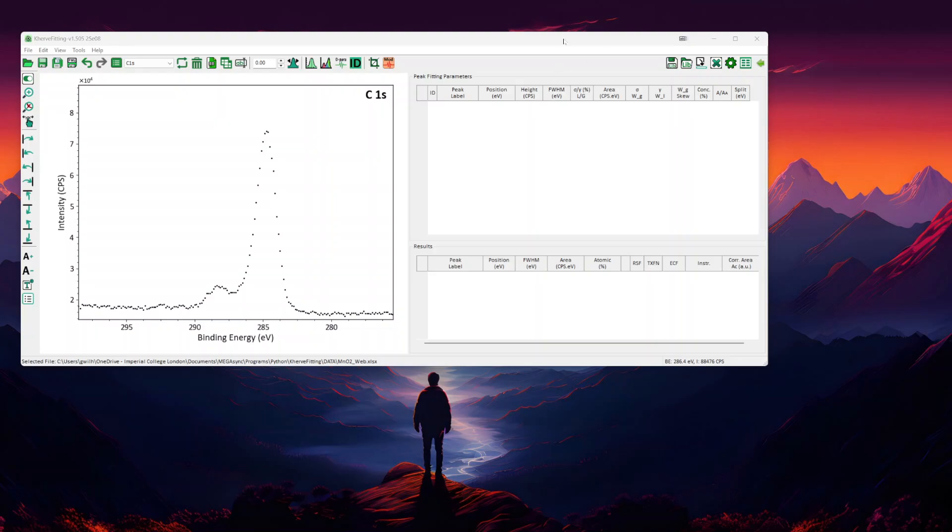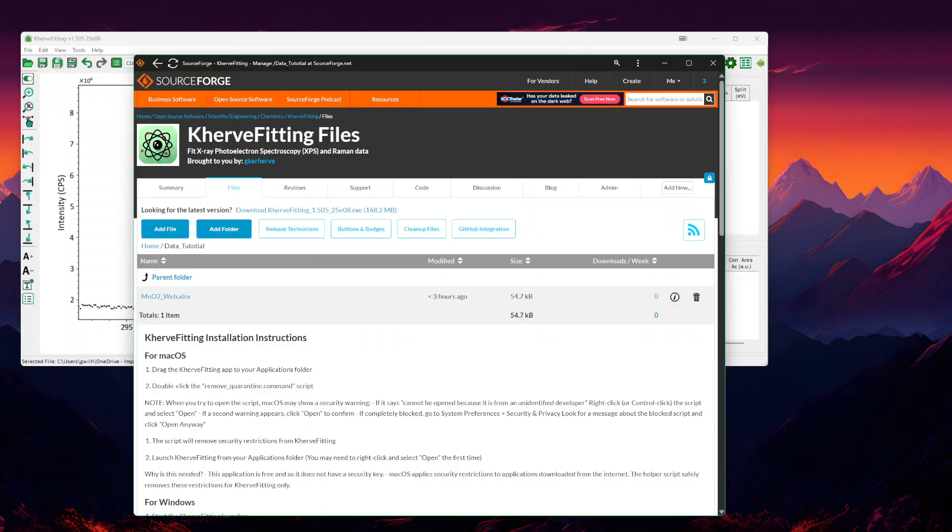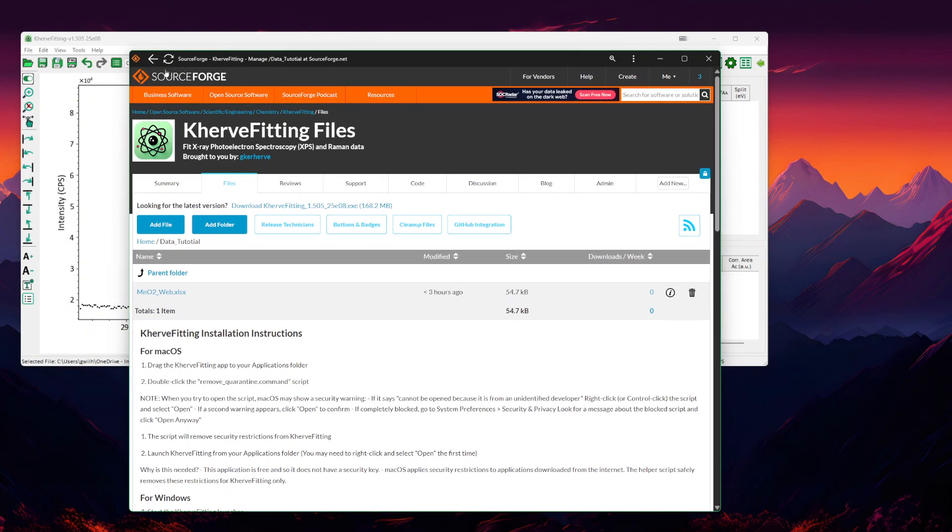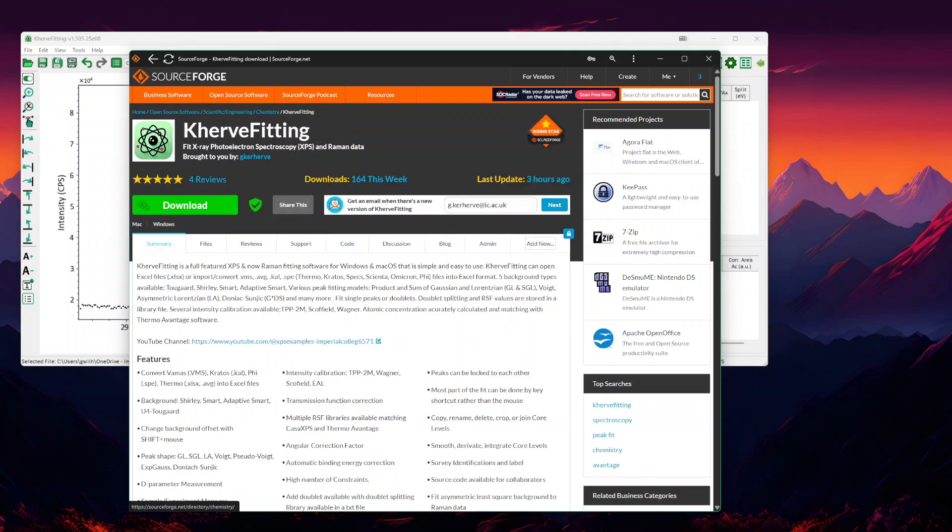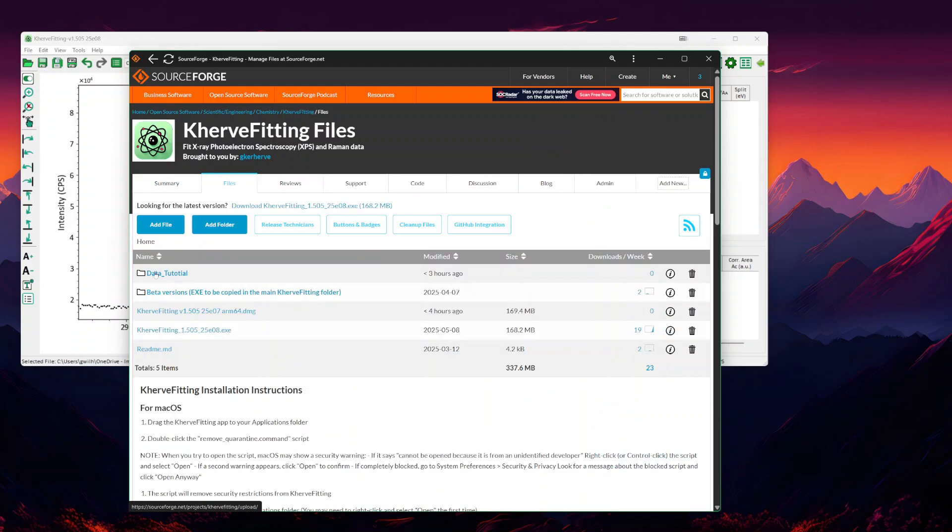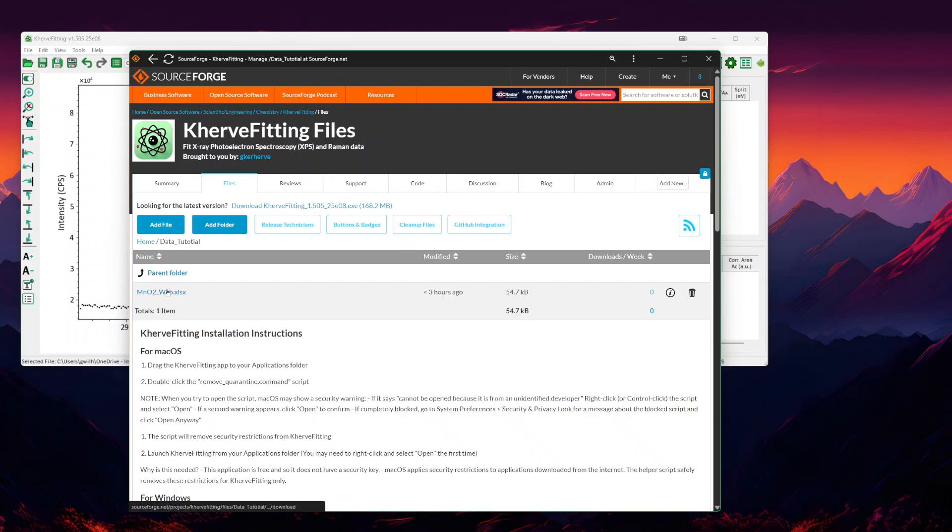This video is the first part of a series on peak fitting XPS using KherveFitting. KherveFitting is a free software available on SourceForge at the address shown here. In the file sections, you have a data tutorial folder where I will add more and more data samples.